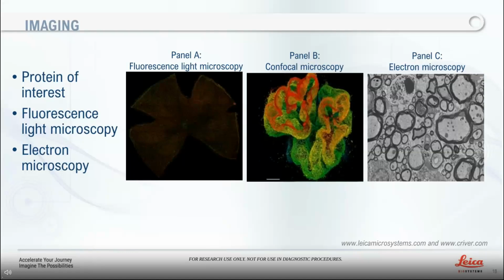So with that being said, do you know if you have the correct protocol for your tissue? How can you understand what is happening when your results are not as expected? I also had those questions, and I will now share several histology hacks that help me understand what was behind those undesirable results and how to overcome those challenges while cryosectioning.